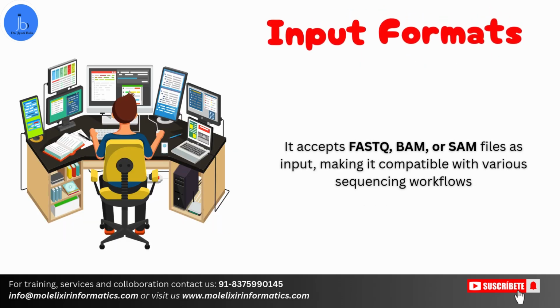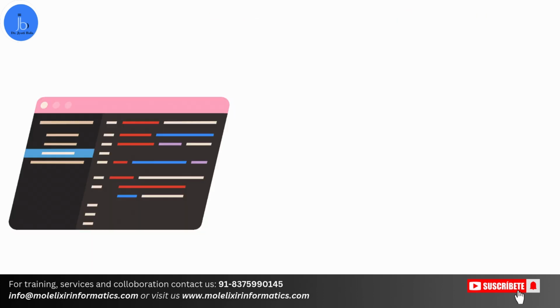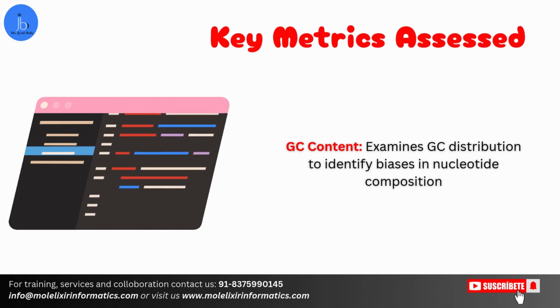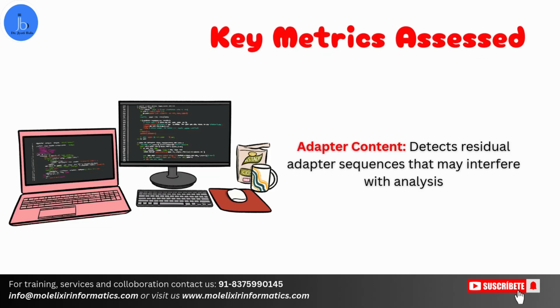In terms of input format, it usually accepts FastQ, BAM or SAM files as input, making it compatible with various sequencing workflows. Now let's focus on the key metrics assessed. The important one is per base sequence quality. It visualizes quality scores across read positions to detect low quality regions. Along with that, GC content, by examining the GC distribution to identify biases in nucleotide composition, and along with that, adapter content, by detecting the residual adapter sequences that may interfere with further analysis.